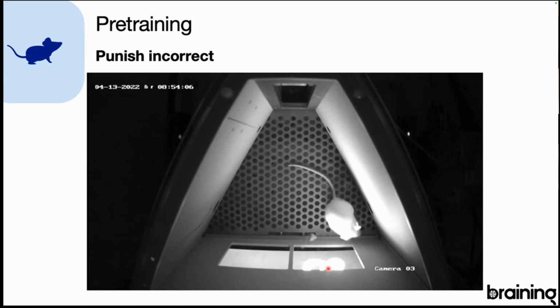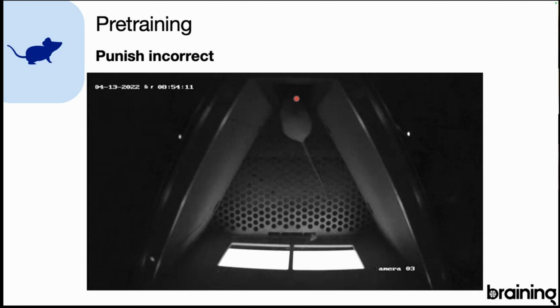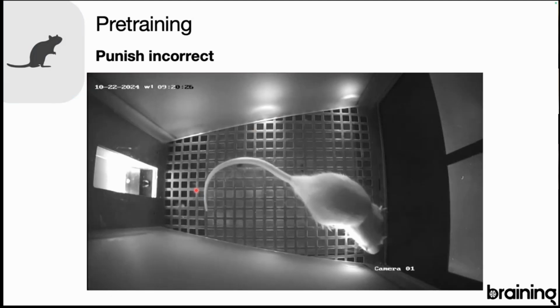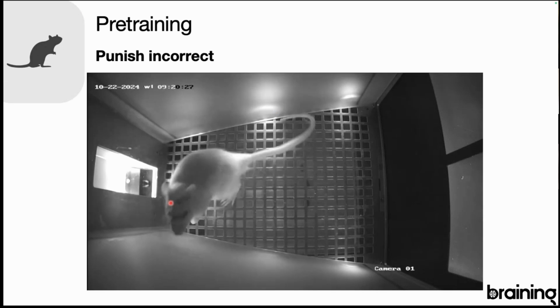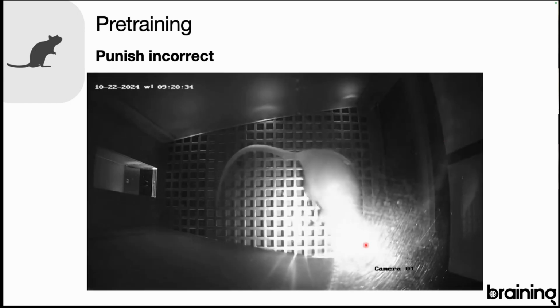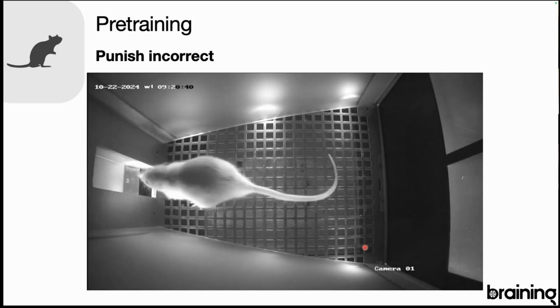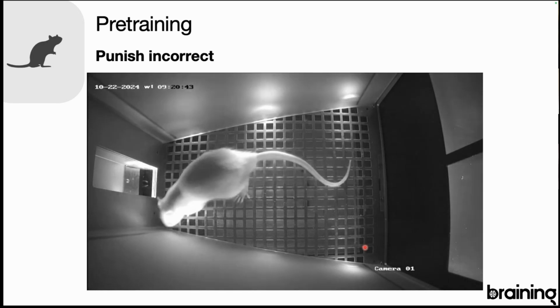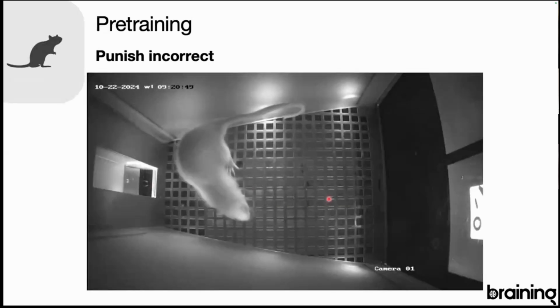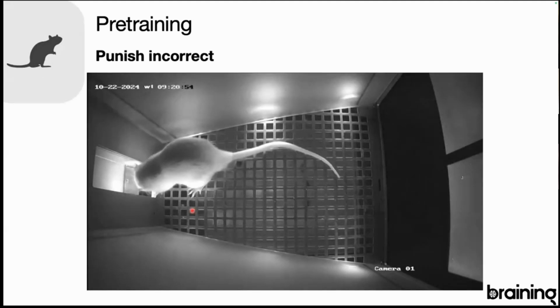So the next phase, the next trial, the animal now touches the image and gets the reward. And the same in the case of the rats. First, the rat needs to put its head into the magazine to start the trial. Then it needs to select this image. However, it chooses the blank screen, so it is punished with this light chamber illumination and no reward. Now we wait just 10 seconds, this inter-trial interval. And the next trial needs to start by putting its head in. And now the rat selects the image and gets the reward.